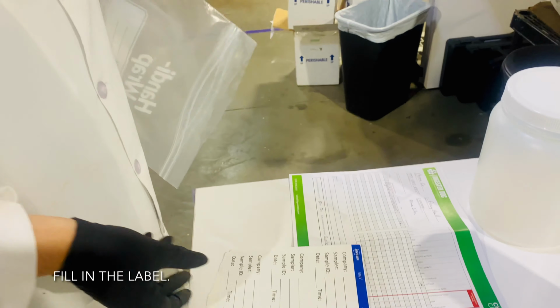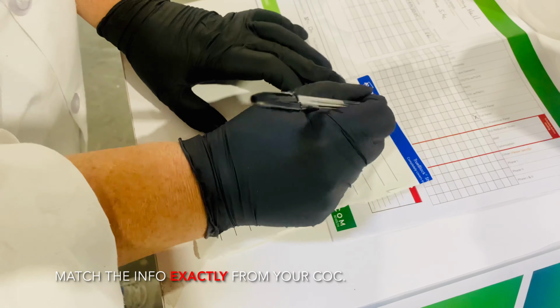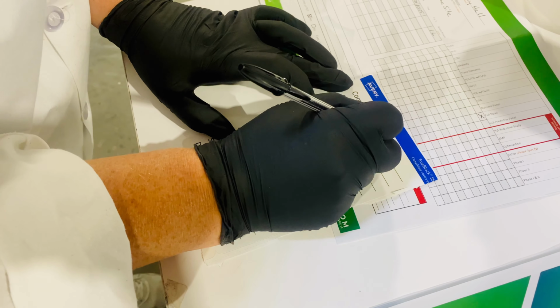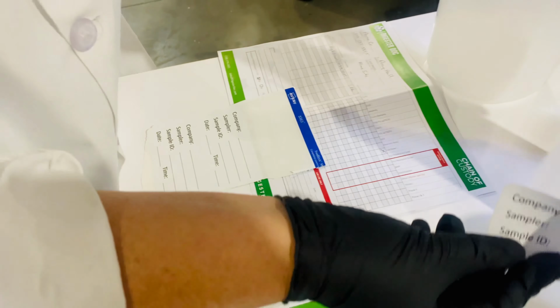You'll want to fill in a proper label to affix to your sample bottle. This label will reflect the same information you put on the COC document. You'll want to place that label directly onto your sample bottle before you collect your sample.